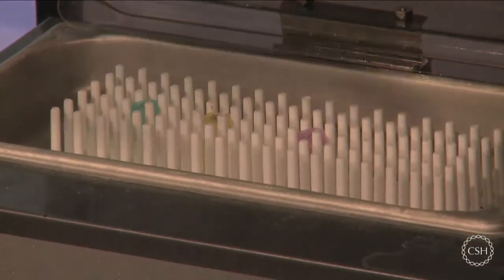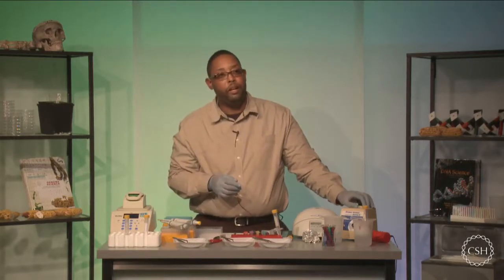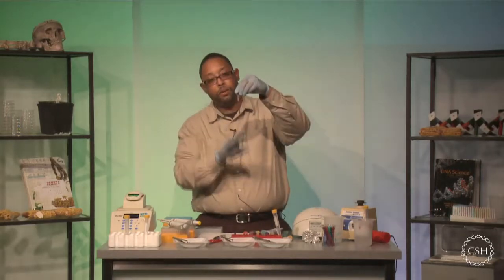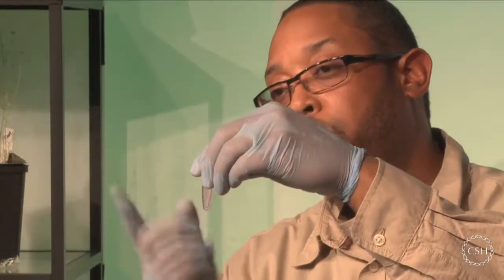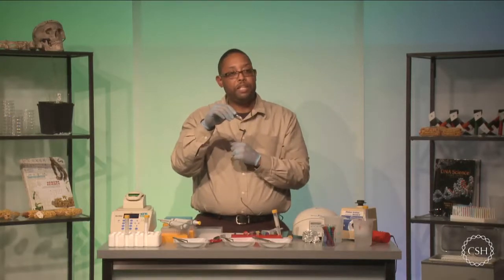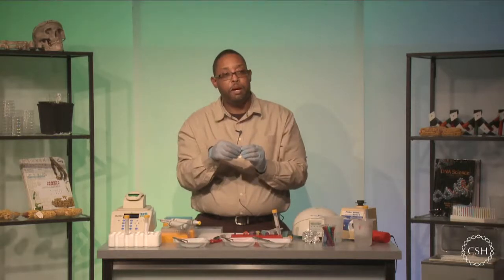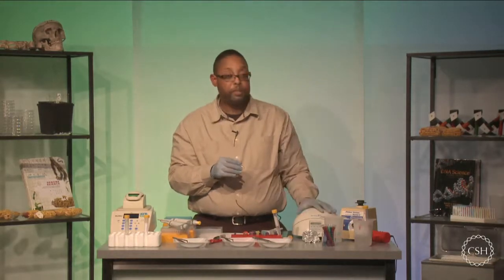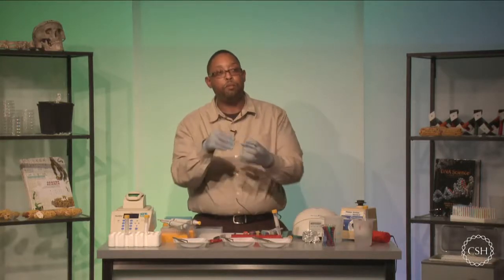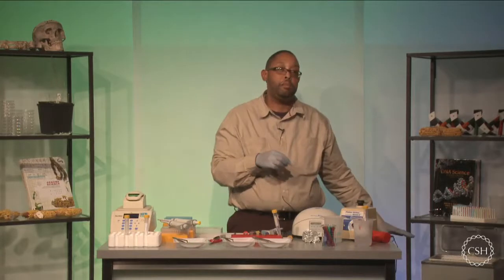Now, if you wish to, you can put your samples into a vortexer to mix them a little bit more thoroughly, or you can finger vortex just by hand, taking your test tube like so and banging the bottom of it just to make sure that everything is thoroughly mixed. Or even if you see things are at the top of the test tube, you can flick it downward to make sure that everything's at the bottom. You do not want to put your samples into the centrifuge, obviously, because you don't want to spin everything down, but just a gentle flick downward will bring any excess material back into the main solution area, and then you can incubate.